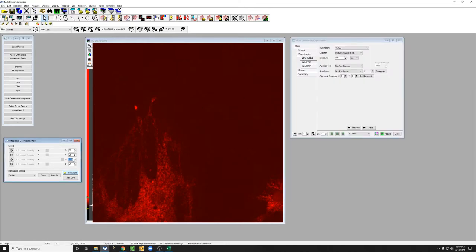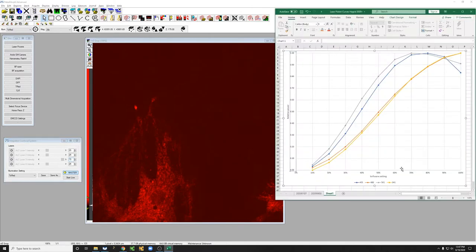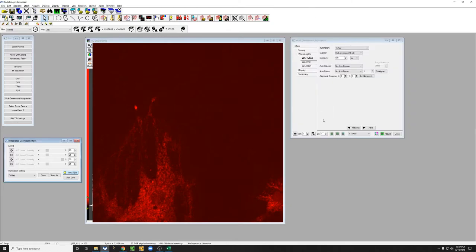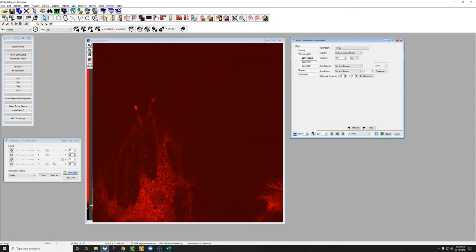So let's set that to 70. By doing that we would expect the signal to go up about threefold. If we take an image, the idea is that this at 70 is going to be equivalent to three times as much exposure with this at 25.